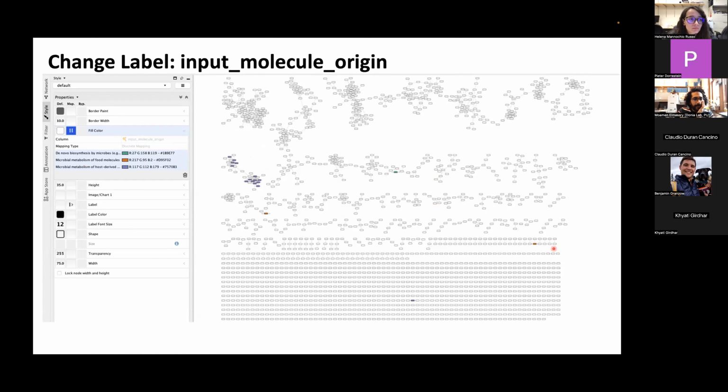So this is where we can have a discussion later on, but basically somebody who curates the knowledge base will provide that annotation. And so it's really the user that decides this. Now, there is a way to edit what somebody else has provided so that you can enhance that information. But the knowledge base is as good as what the community is able to provide. So it's a great question. I mean, in this case, I think the majority of tryptophan comes from diet. I think relatively little comes from microbes, but on the other hand, you can't exclude it.